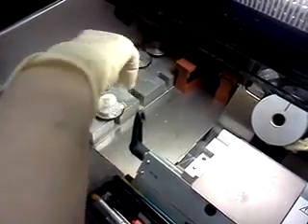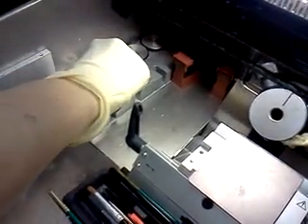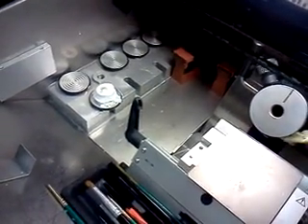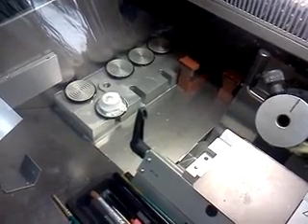Okay, so you put a little pad there and then you just pop that in there and you let it freeze. That's it. But you didn't have to put as much as I did. All right, and then you keep this closed to let it do its thing.